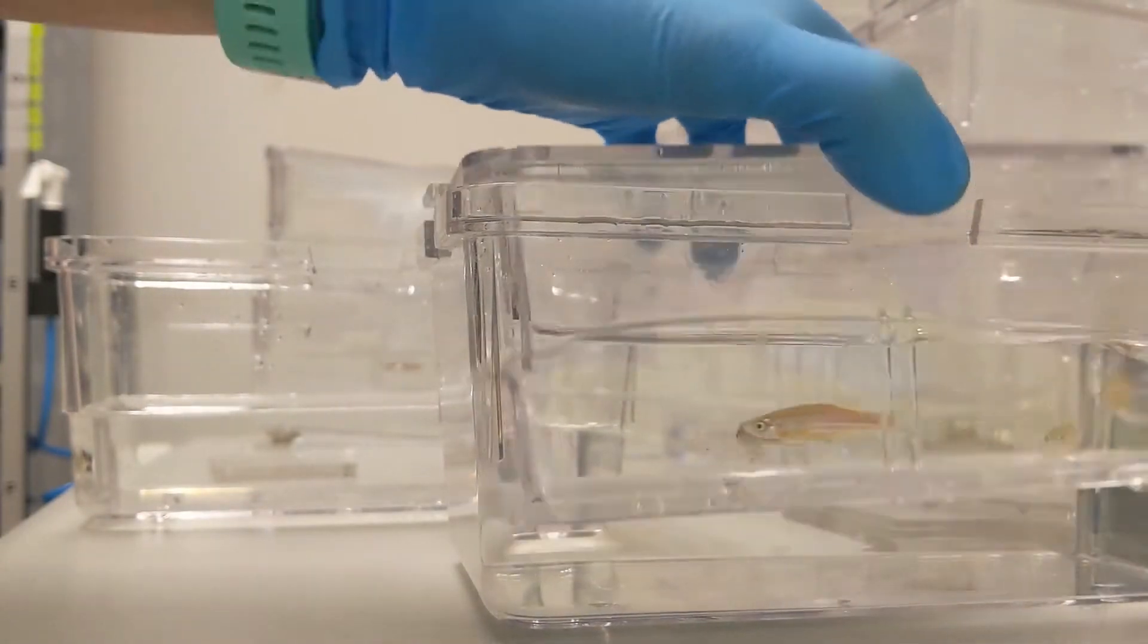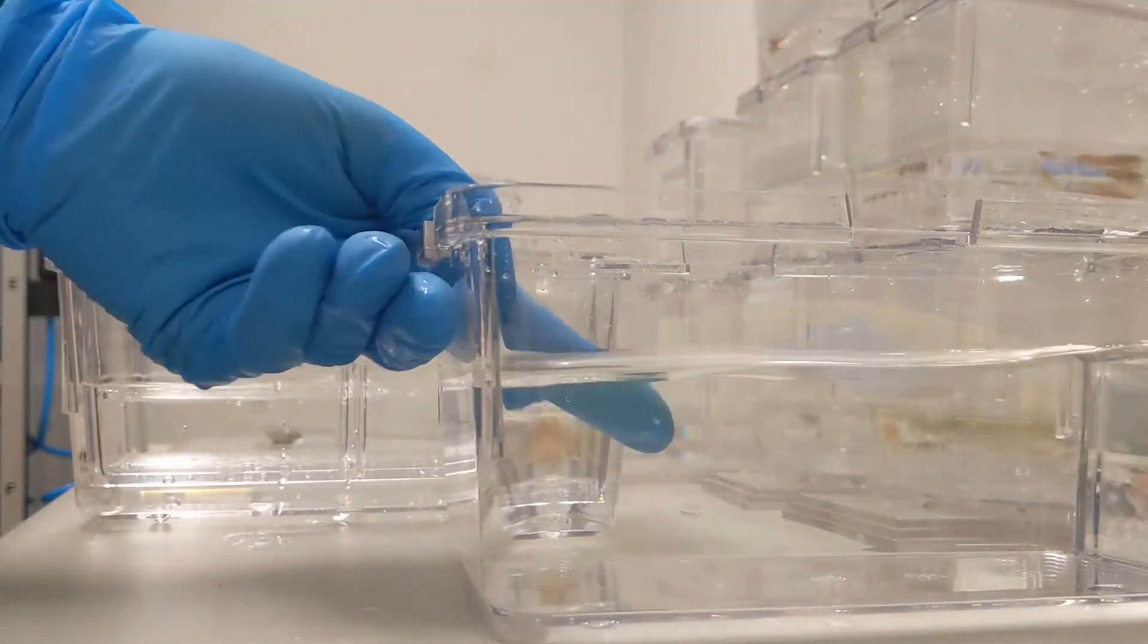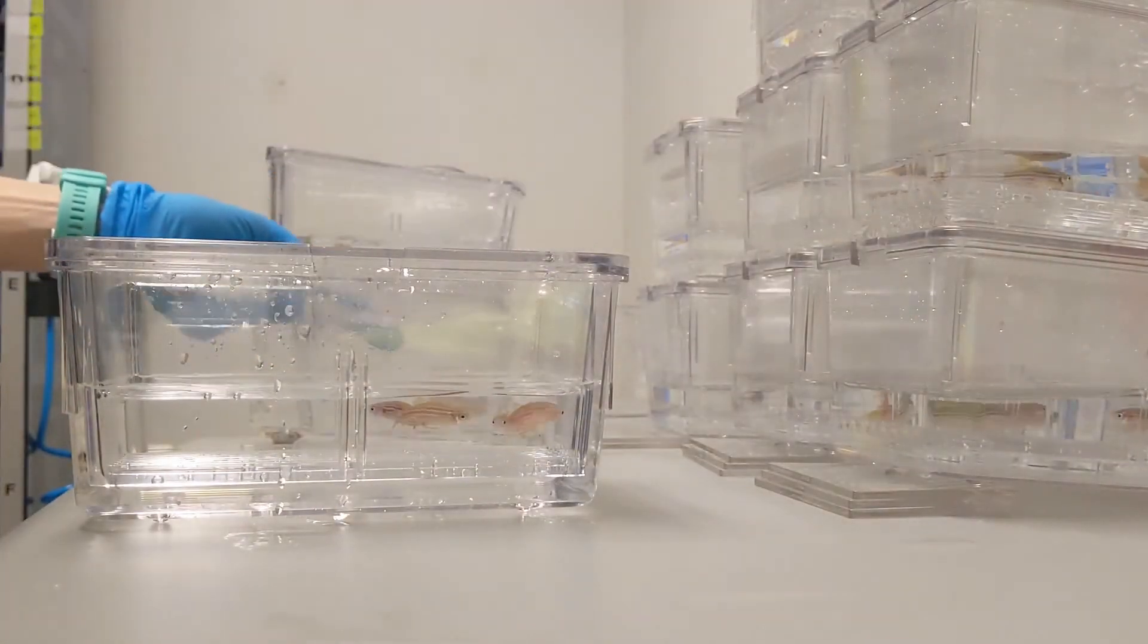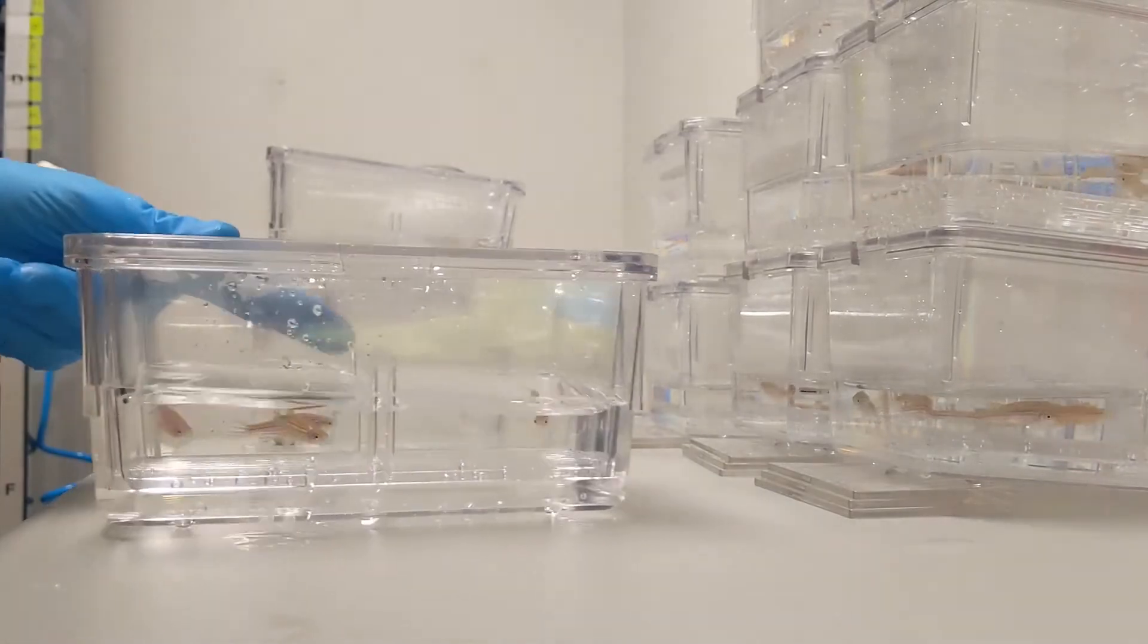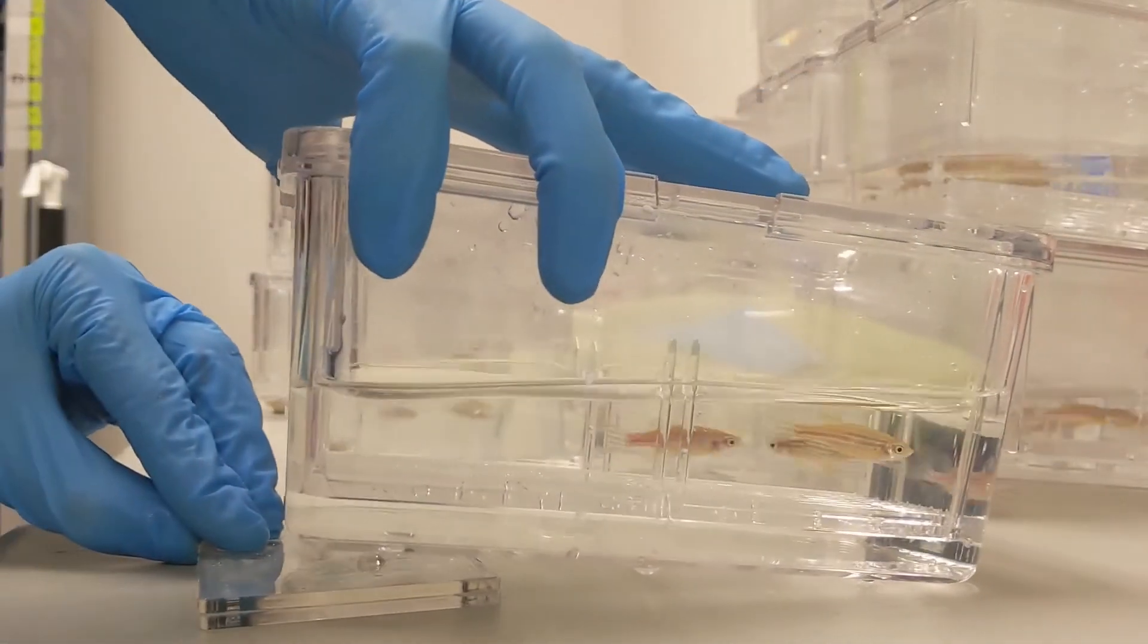The following day, we pull the dividers and move them to a lower volume of water and put them at an angle to simulate a slope in their natural environment. This can entice them to breed more than being on a flat surface.